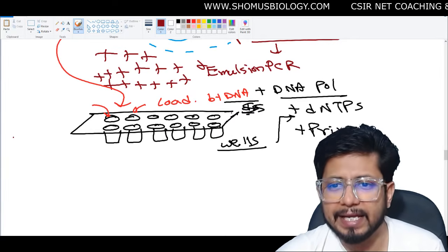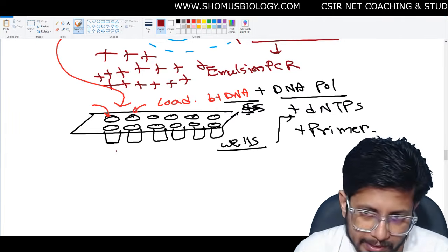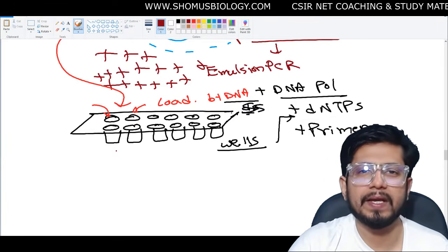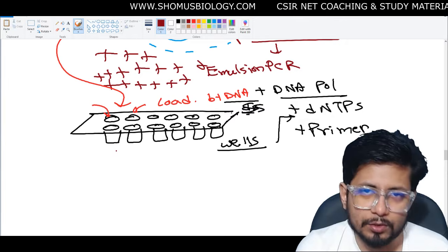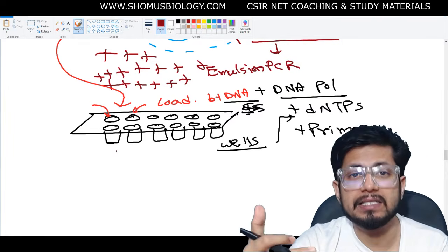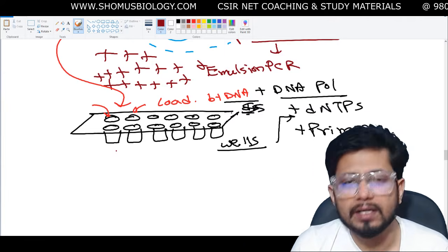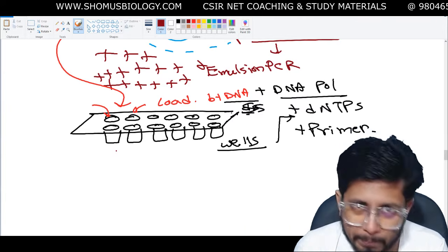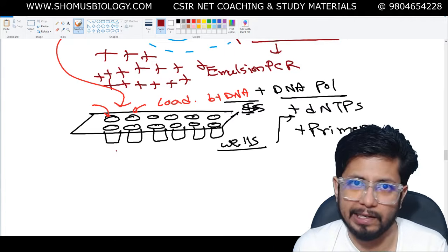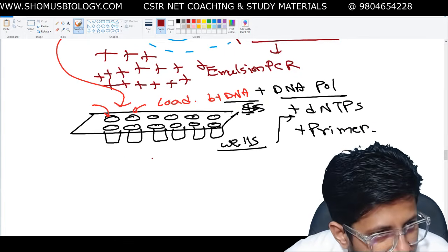And again here we will apply the same logic that we applied in most of the DNA sequencing techniques. We are simply trying to do a DNA replication. We try to make a copy of the DNA using the target DNA as a template. The target DNA, the template DNA, is the DNA that we are about to sequence, right? So we are trying to sequence it by adding new nucleotides complementary to the nucleotides that are shown by the target DNA in there. That's what we are doing in this case. So we will load everything here, okay?